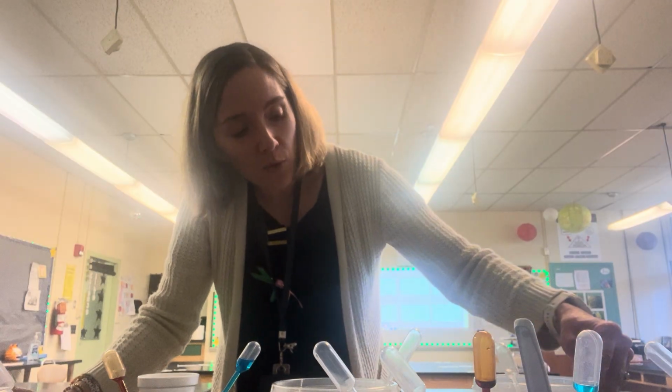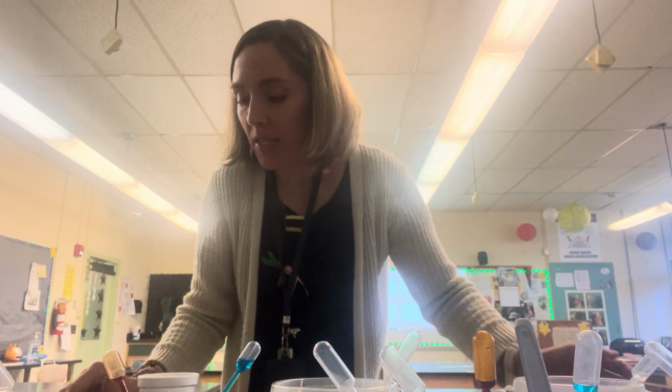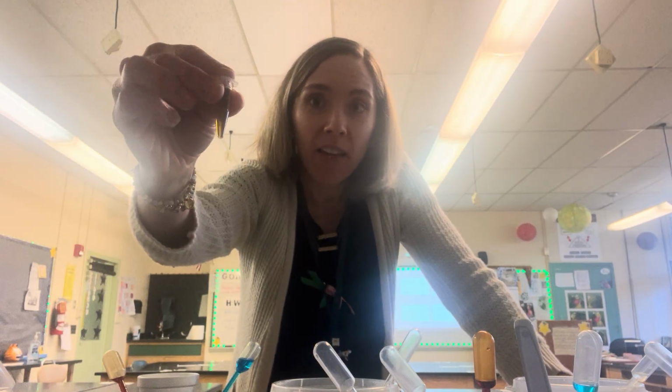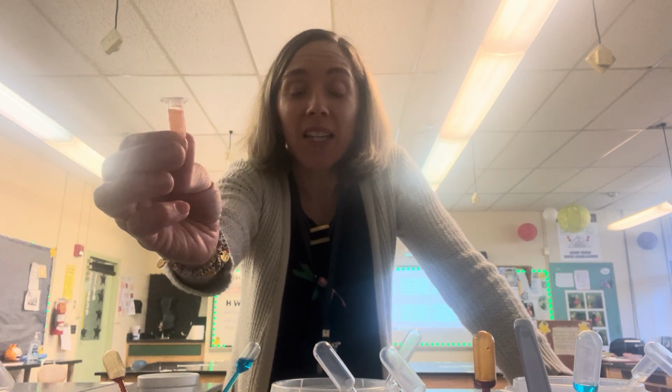Then we did the same test with the liquid that came from the food that had been sitting with the amylase in the water, kind of like our saliva. We tested tube C with iodine to look for starch, and we found that it turned a blackish color. Tells us that there's still some starch there. We tested tube D with Benedict solution to see if there's glucose after it's exposed to amylase, and we found it turned orange. That tells us that there is glucose in the rice now because it's been exposed to the amylase. We have just witnessed a chemical change occur.